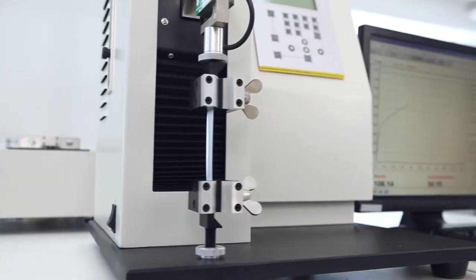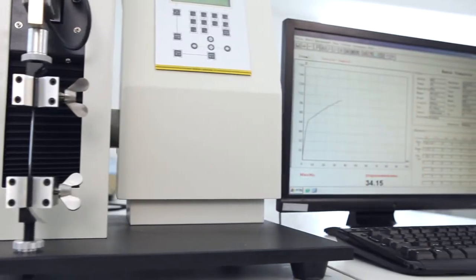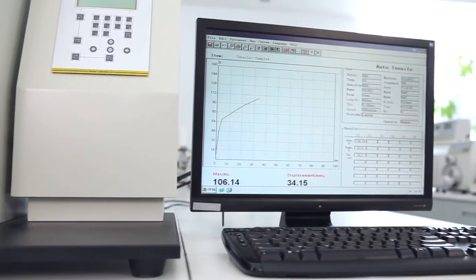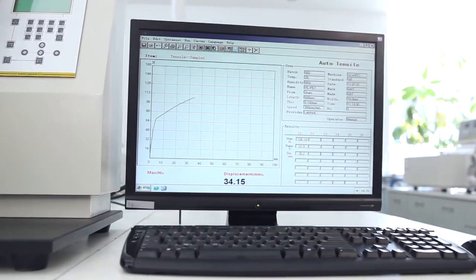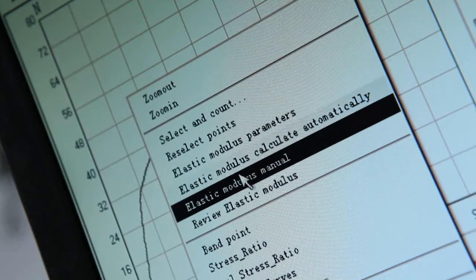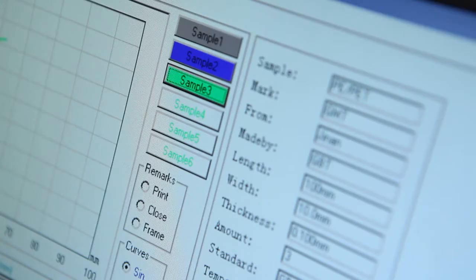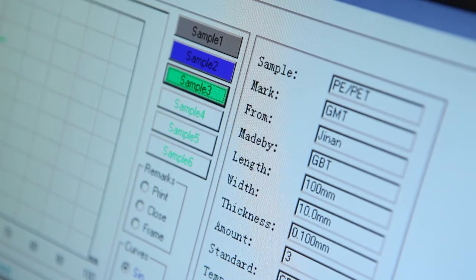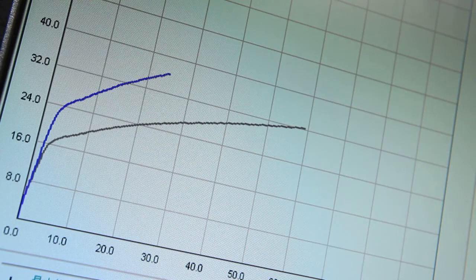The testing software designed by LabThink has an intuitive operation interface, visual display of real-time data and graphs. It can calculate the tensile stress at a given elongation, elastic modulus, and stress strain, and carry out historical data comparison and curved superposition analysis.